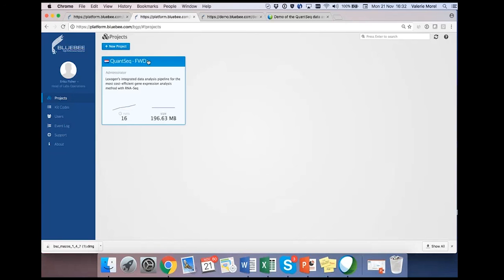So they extended the 3' UTR downstream to, I don't know, a couple of kilobases or so. The annotation was not so good there. But for mouse, human, and rat, it's so well annotated in Ensembl that you don't need extra definitions.